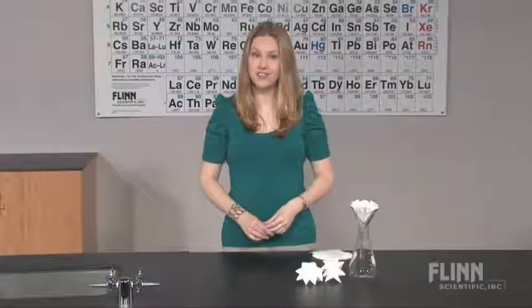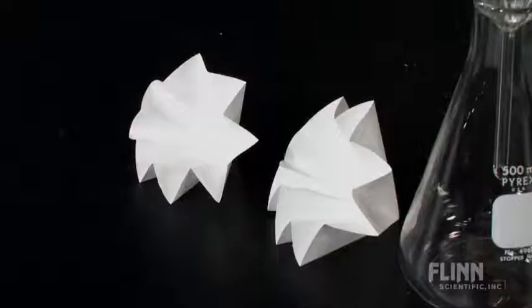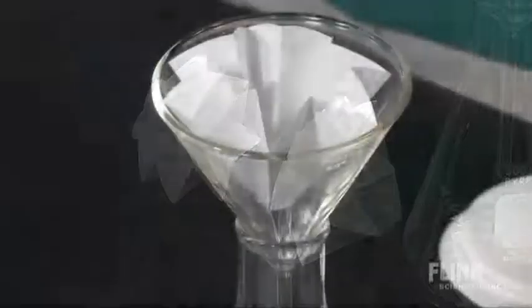Use fluted filter paper to increase the speed and efficiency of filtration when removing undissolved solid residues. Folding the filter paper in this way increases the surface area during filtration, saving you valuable time.